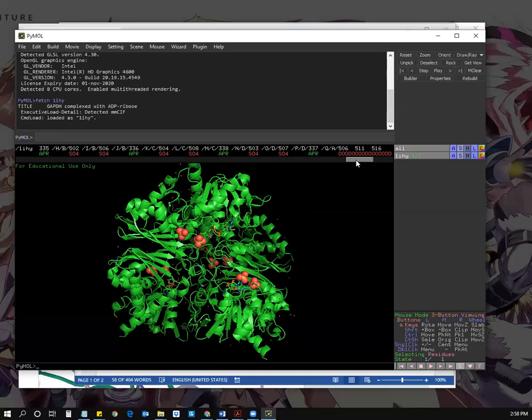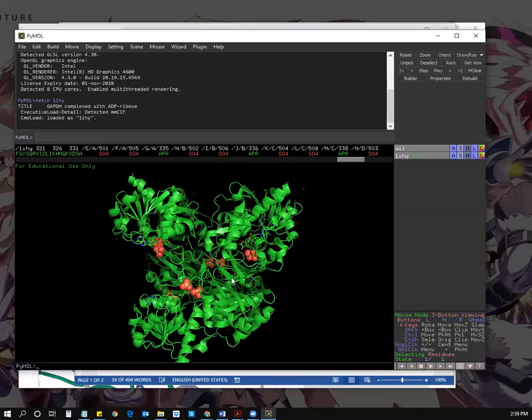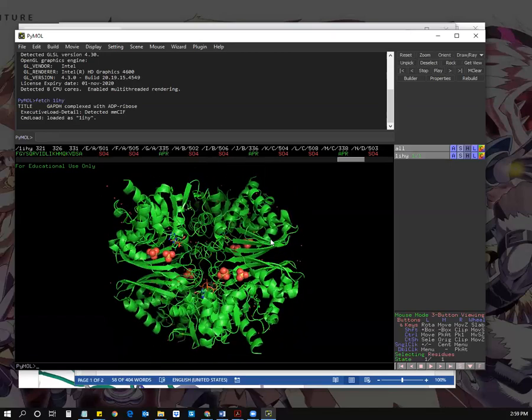All right, so what I'm going to do now is we need that picture of our ligand with the protein surrounding it. It doesn't matter if you take a picture in the chain that you are going to use in the end, or if it's a different chain. We just want to see the ligand and then also the protein surrounding it afterwards. So I don't want to deal with this very complicated tetramer picture either in the foreground or in the background, adding too much stuff that's going to be visually in the way.